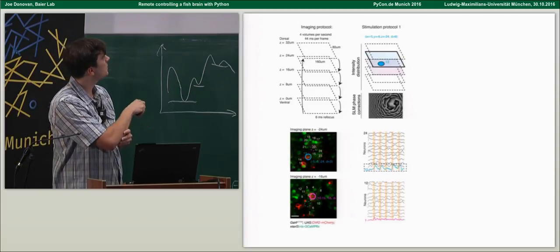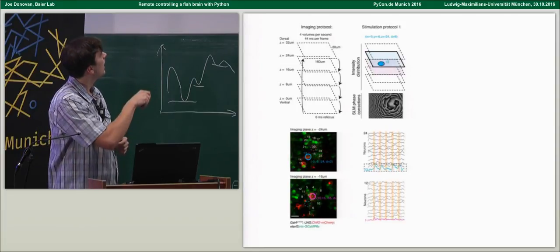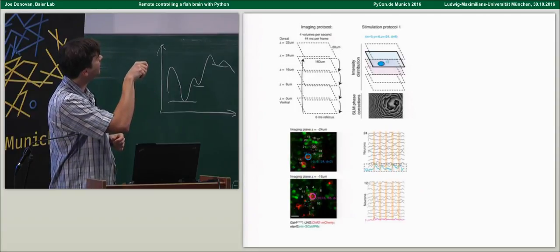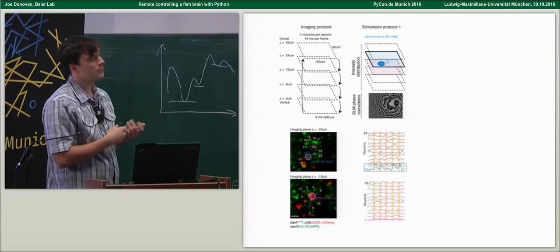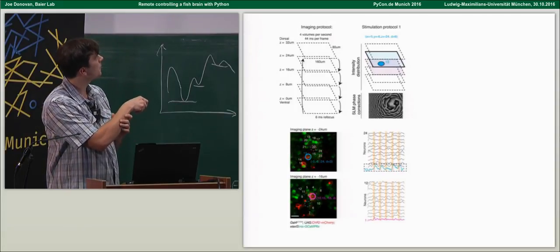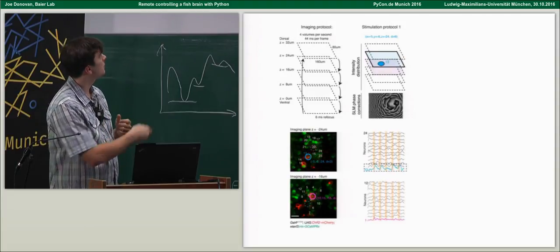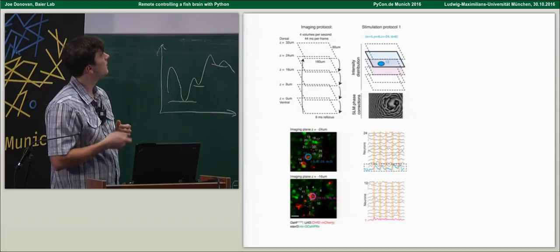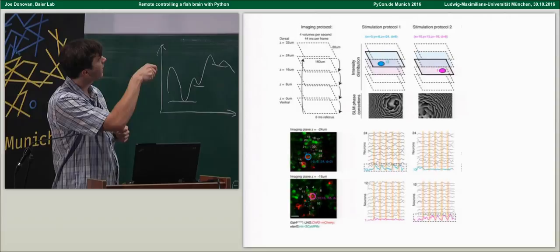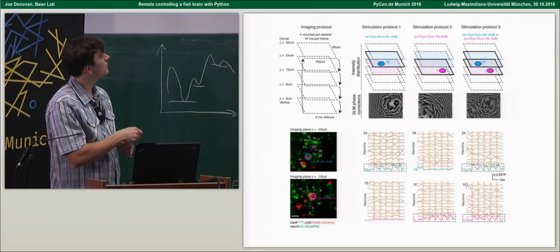And we can do our imaging and stimulation. What's here is an activity trace recorded from the neurons, and the yellow bars are when the stimulation is active. In this case we targeted cell 13 for stimulation, and we can see that when we photoactivate, the neuron is excited and the activity increases, but not in the other neurons. And this is the SLM correction pattern that generates this distribution in space that corresponds to this neuron. We can also choose some other neuron, do something similar, with a different spatial pattern and different excitation, and we only activate this neuron, or we can do multiple neurons simultaneously.